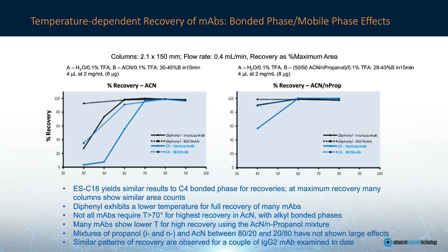Now, I'm going to take a couple minutes to talk on this slide. This is a fairly important slide. Temperature dependence is key to understanding some of these effects that we see on these superficially porous materials.